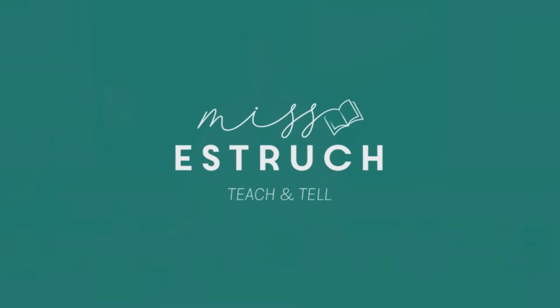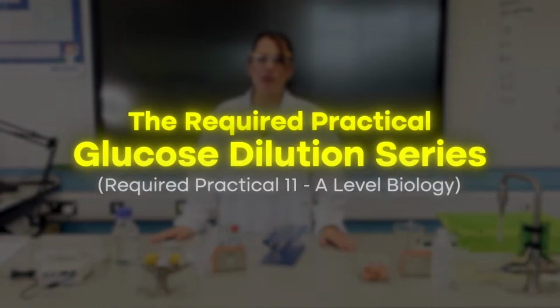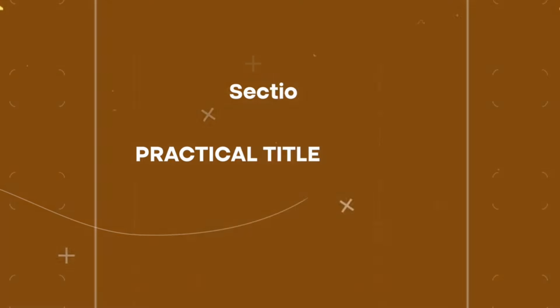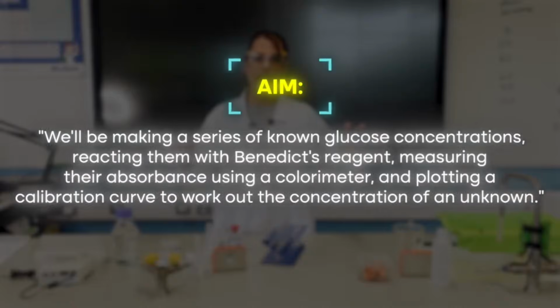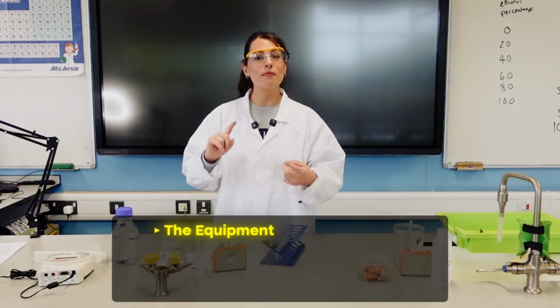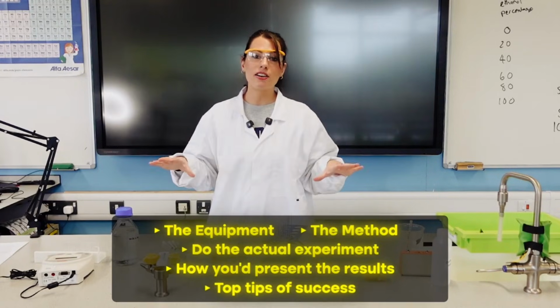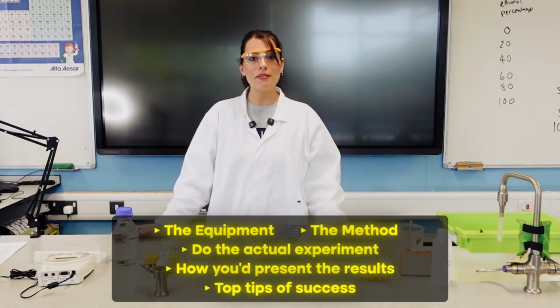In this video, I'm going to be going through required practical 11 for AQA A-Level Biology, which is preparing your glucose concentrations with the dilution series and then using your colorimeter to create a calibration curve. And you can then use that calibration curve to identify unknown concentrations of glucose in a hypothetical urine sample. So we're going to go through the equipment, the method, do the actual experiment, how you'd present the results, and I'll tell you some of the top tips for success to share with your students.